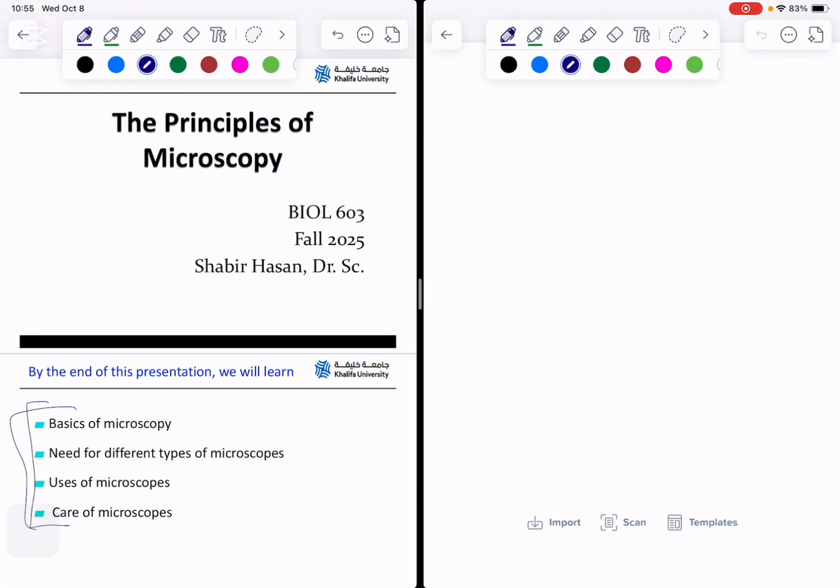So the basic concept of microscopy is that our naked eye, so let's assume this is my eyes, can only see anything down to 0.25 millimeters. And what this means is basically that when I have two dots, the ability that I could differentiate that, you know what, these are two distinguished dots, comes down only to 0.25 millimeters.